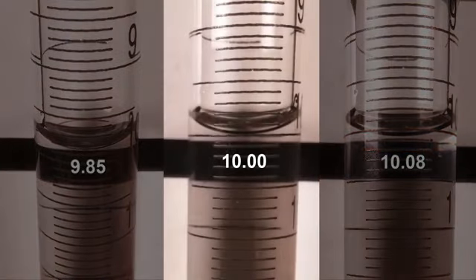In the last example, the meniscus is at eye level and in this case the encircling ring from the 10.00 milliliter mark appears as a single line. In this case the proper reading of 10.00 can be achieved.